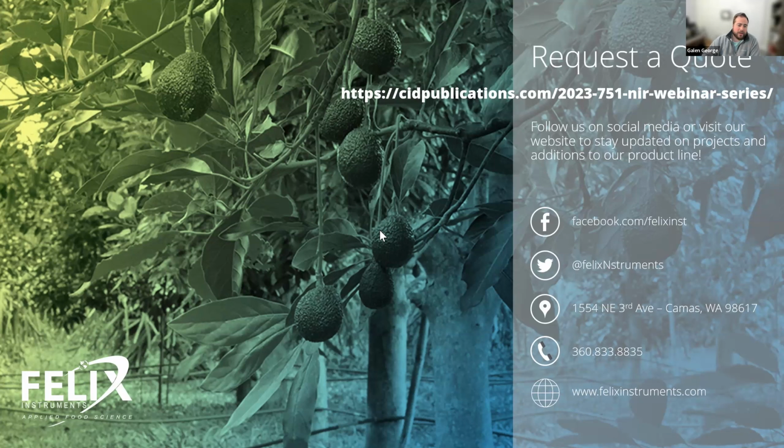The next question: how many spectra will we need to build a sturdy machine learning model? This is the most commonly asked question when people ask us about building models: how many spectra, how many samples do I need to build a good model? And there is no answer for that. There is no way we can just give you a number and have that be even close to what might be needed. In general, it's going to require data.